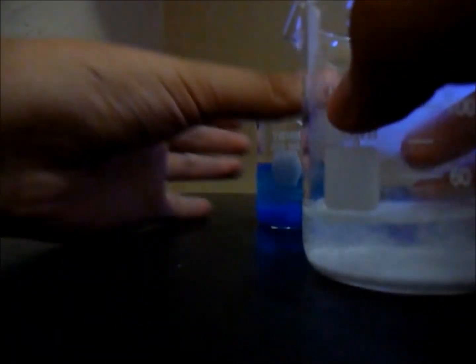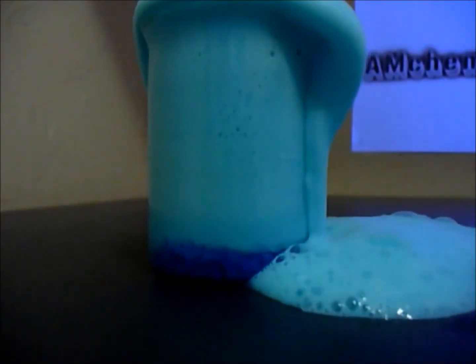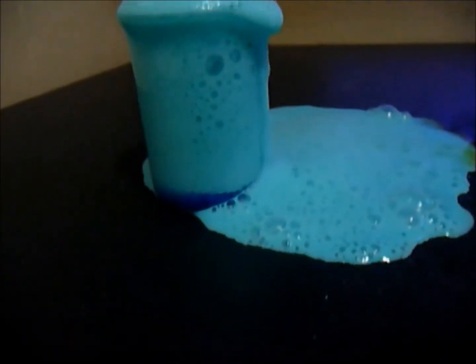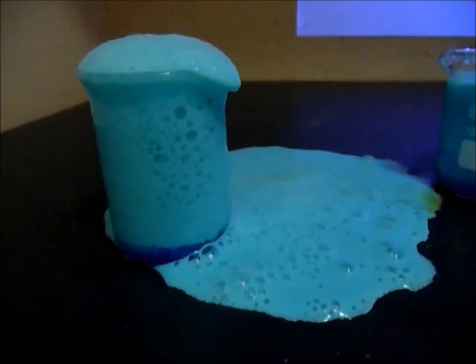So this is sodium bicarbonate, which is NaHCO3, and look what happens. You see, it spills over because it's evolving a lot of hydrogen—I mean CO2, which is carbon dioxide.